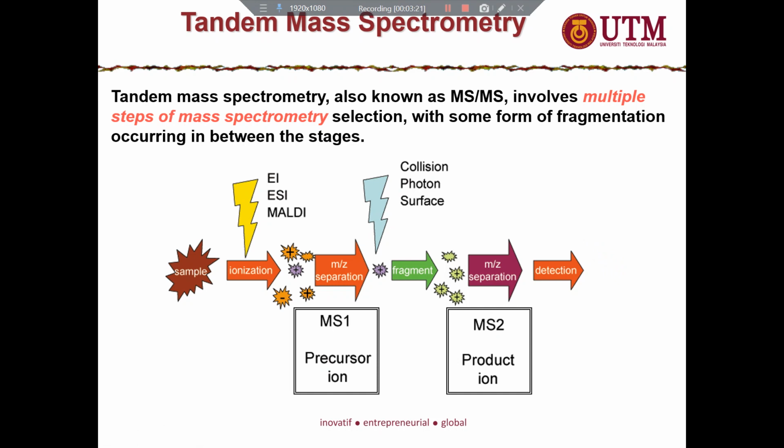Alright. In the MS, we can also imagine it like that. The first one you screen. Contohnya you screen orang ni adalah lelaki atau perempuan, berapa saiz dia apa semua. Kemudian you akan masukkan detail yang lagi tinggi, itu detail yang you tengok pada yang kecil-kecil. Tadi you tengok yang besar-besar, maksudnya you tengok saiz dia, you look for the gender, you look for its size.